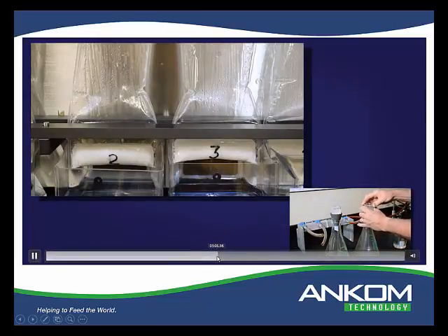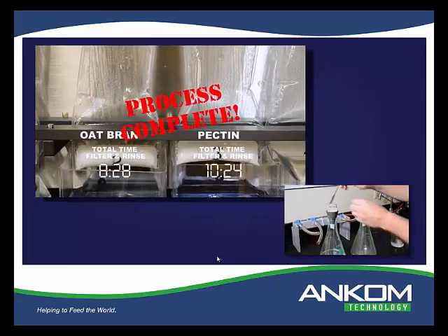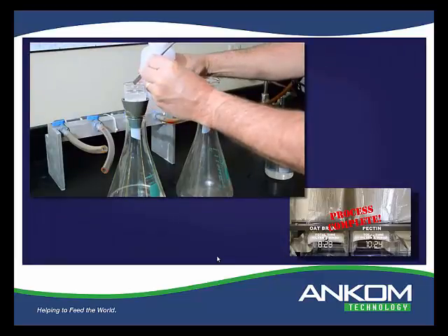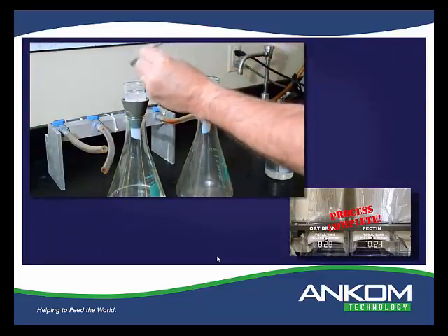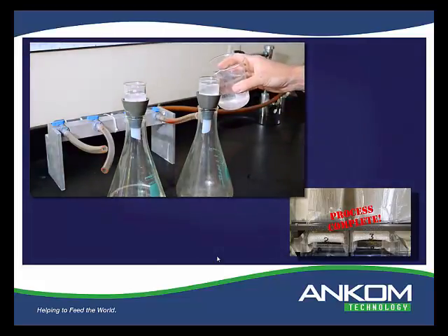One of the things that's interesting about when I did this, there's your time, 8:28 for total time for oat bran, 10:24 for the other ones. So we'll just write those down just so I don't forget them. My goal in this presentation was to be able to show just how much time difference there is between the methods.